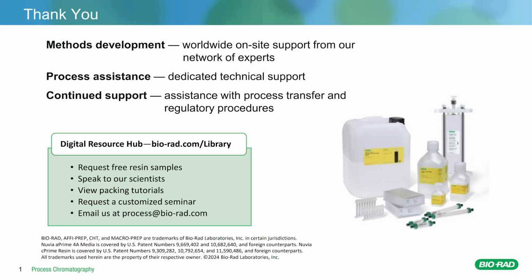That's a great question. Purified endotoxins are used for a variety of purposes, such as in research, in diagnostic kits, as well as in assays, such as sepsis diagnosis and quality control. Purified endotoxins are also used to explore endotoxin removal methods, such as in the example of CHT described here. Additionally, in biotech, researchers are investigating alternatives to commonly used expression systems such as E. coli through modification of the endotoxins. So here would be another use for purified endotoxins serving as controls in assays, for instance.